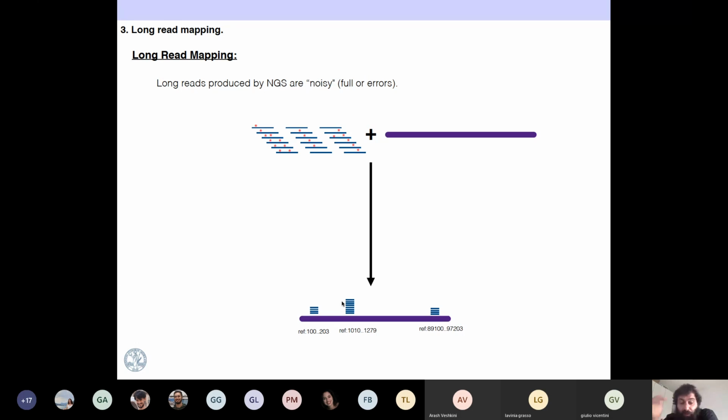So it's easier to just sort by coordinate and say, okay, I'm reading by coordinate. For gene 1, I have 1, 2, 3, 4, 5, 6, 7. Let's move to the next coordinate. For the next coordinate, I have 1, 2, 3. Let's move to the next coordinate. For the next coordinate, I have 1, 2, 3, 4, 5. So it's easier than jumping from one place to another trying to quantify the reads. That is the reason why you need to sort the BAM files.